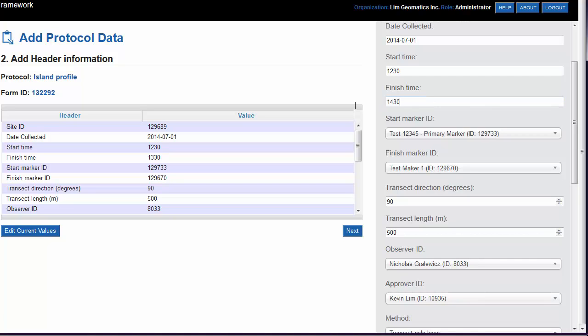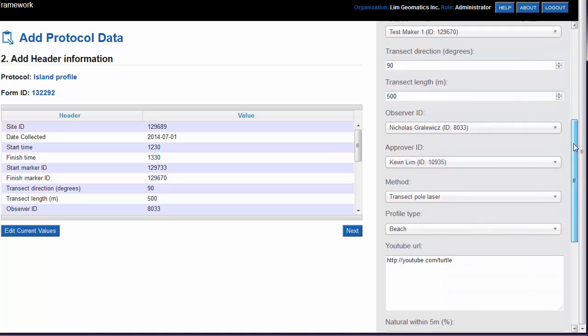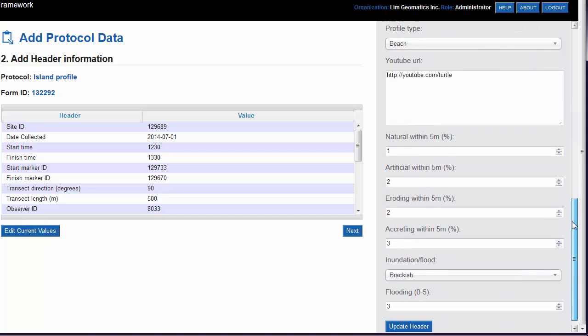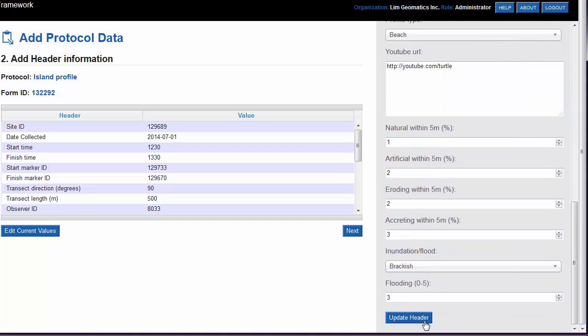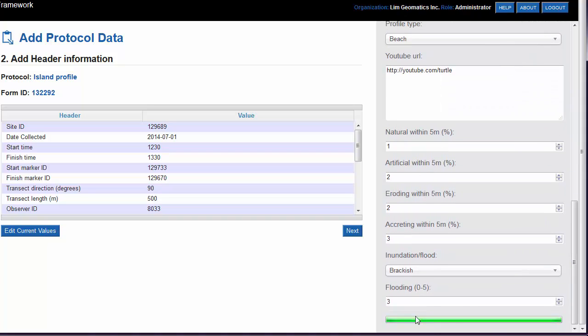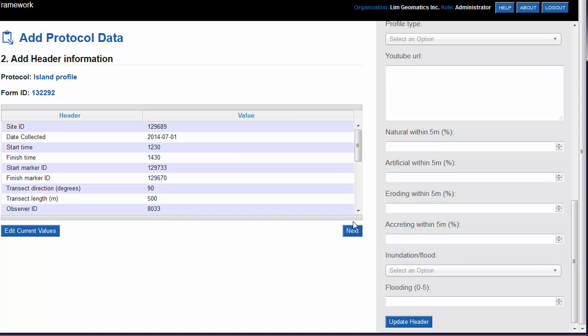Here we'll change it to be at 2:30 instead of 1:30. Scroll down to the bottom and click on the Update Header button. Click the Next button to finish adding the header information.